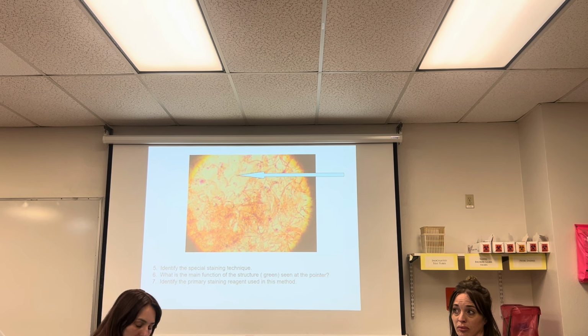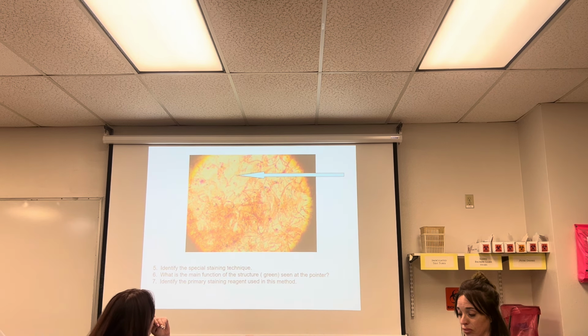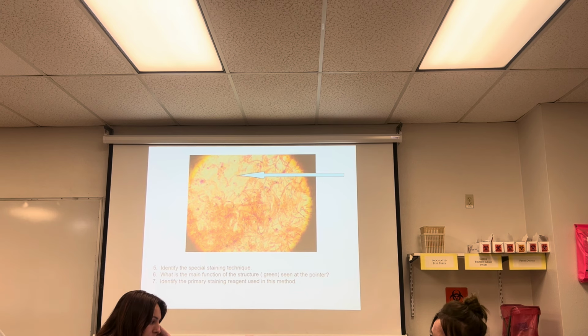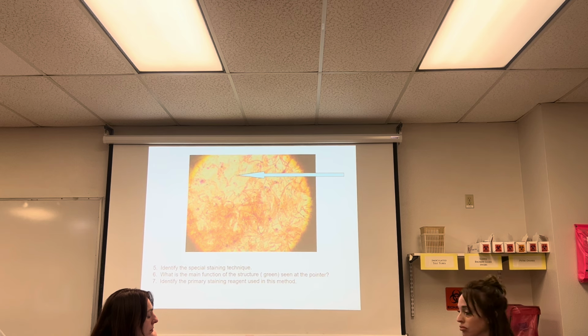Everybody with me? Okay. Other things I can ask is, what's the counter stain? And you'll say what? Safranin. What's the decolorizer? Not in this one. What's the decolorizer? I heard acetone alcohol. That's for Gram stain, right? Yeah, that's for the Gram stain.